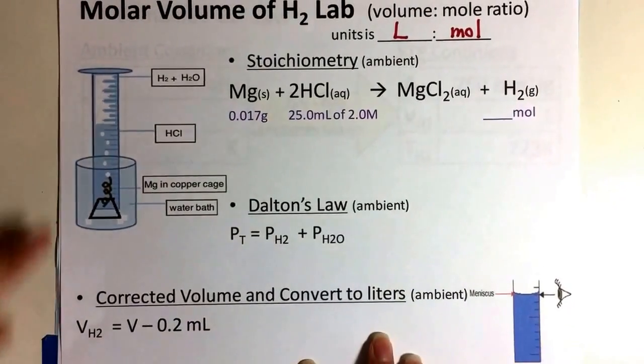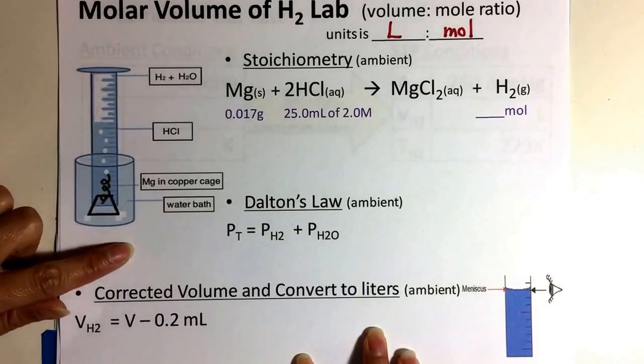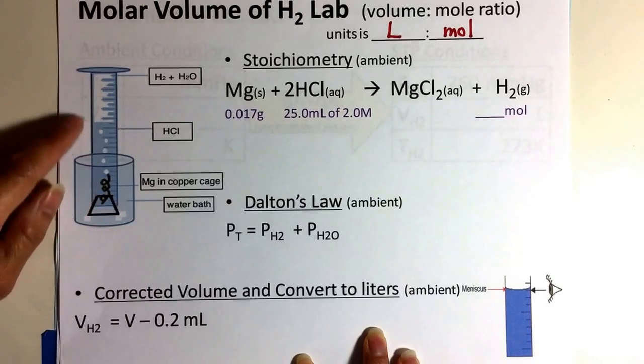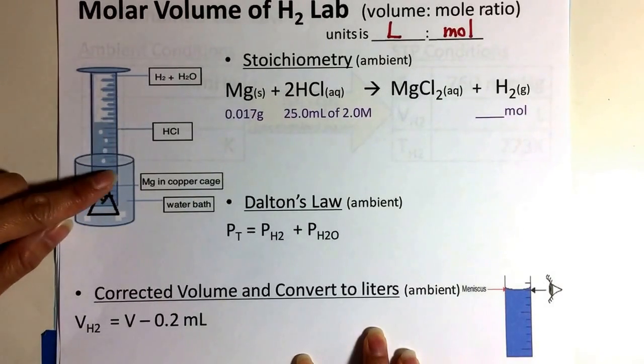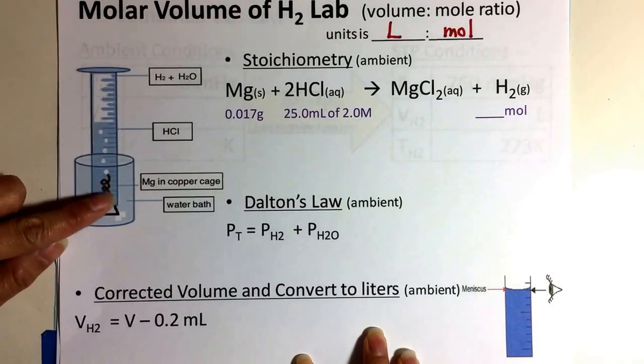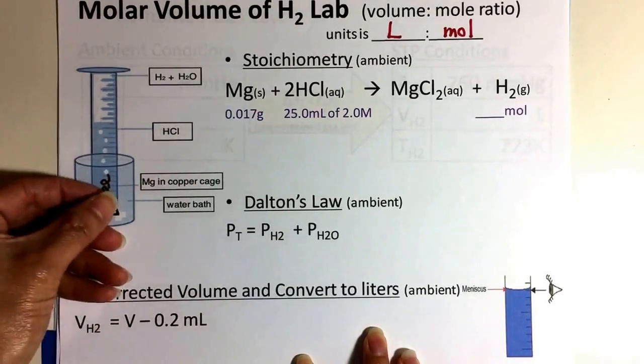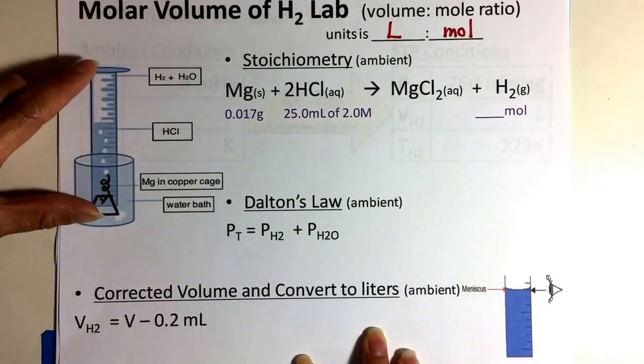So we have here, just to remind you of the setup, we took a piece of magnesium, we put it in our copper cage, and we poured some HCl into our graduated cylinder. And then we buffered it with a little water to make sure that the reaction doesn't take place immediately. We capped it, and then we inverted it into a water bath.